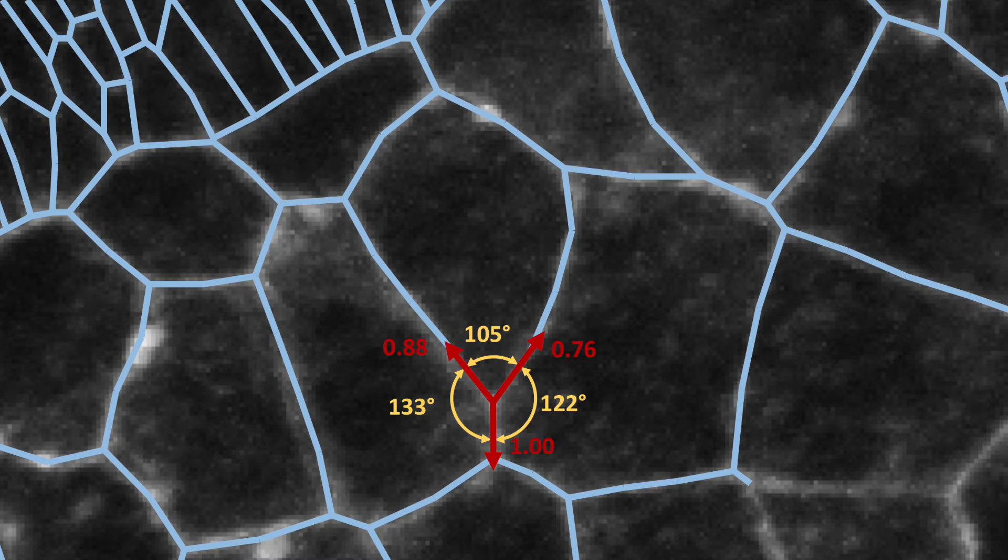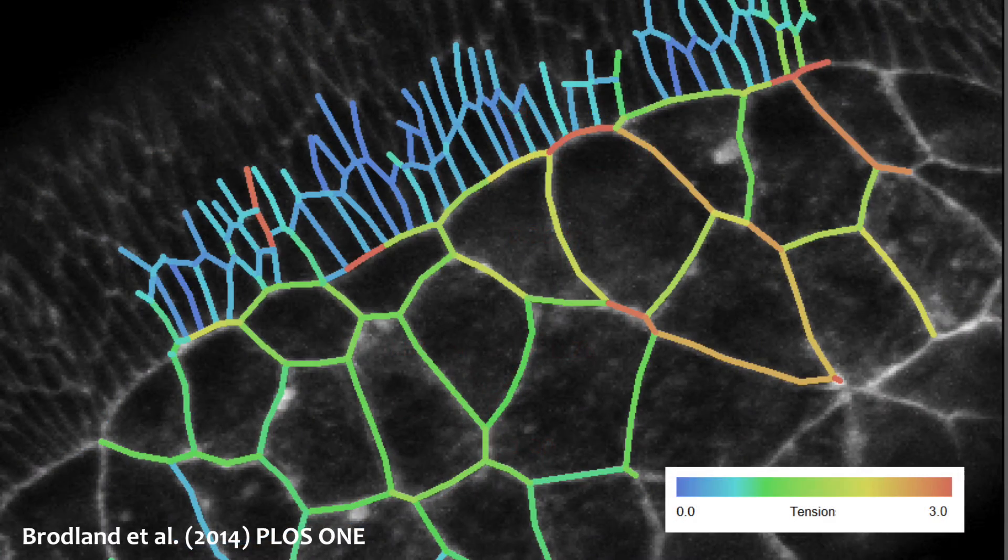If we then assume the tension in any given edge to be constant along its length, we can repeat the process until all the edges of interest are analyzed and a color-coded edge tension map constructed.